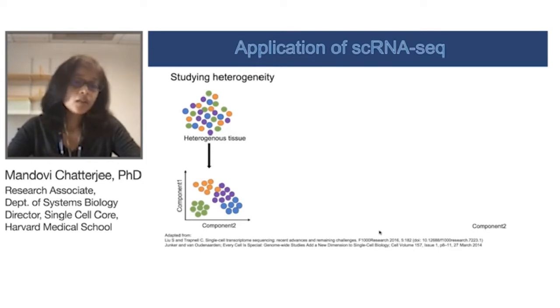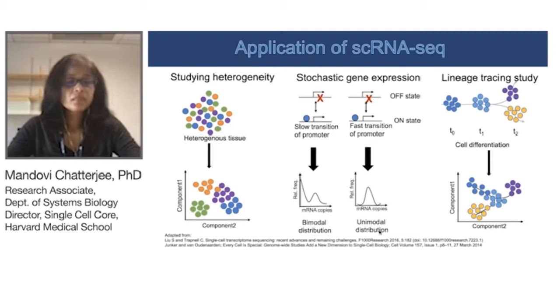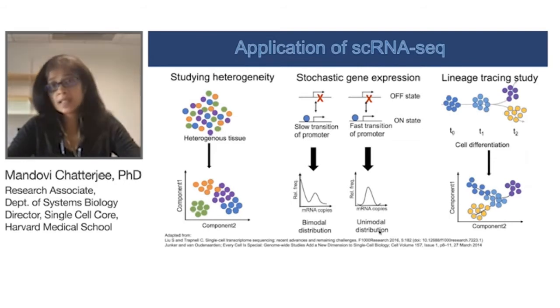Now single-cell RNA sequencing has enabled us to look at the variability in the gene expression within a particular cell population as well. Moreover, with the advances of single-cell RNA sequencing, it is now possible to build a detailed cellular atlas of complex and dynamic biological processes, including developmental trajectory and time course experiments.